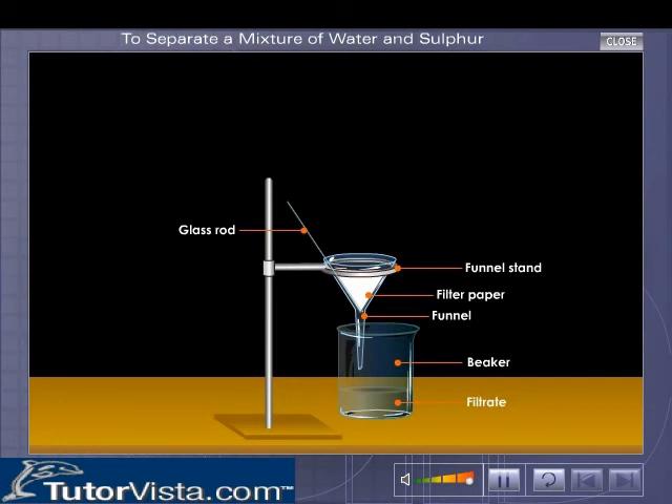The solid sulphur is left on the filter paper and is called residue. The filter paper is gently removed from the funnel and is dried to recover the sulphur.